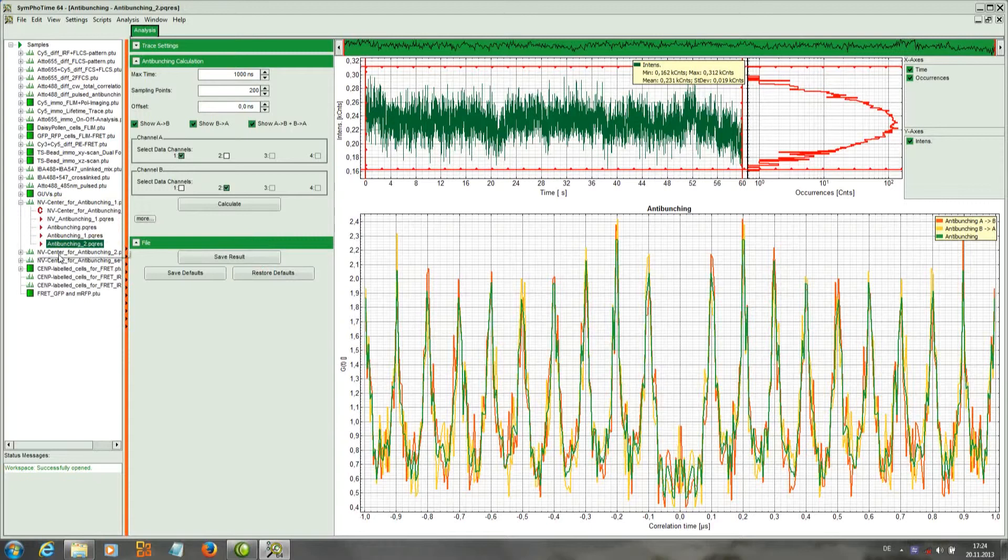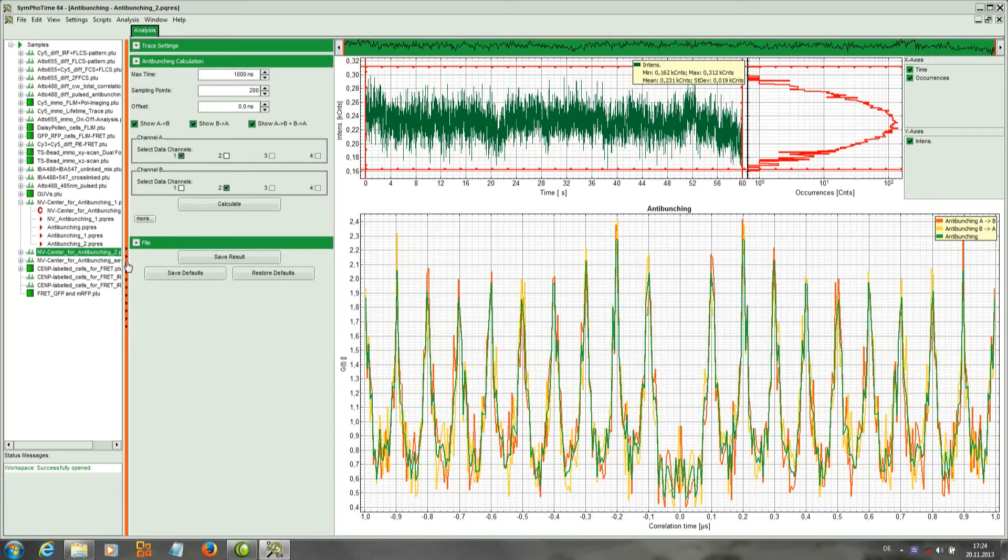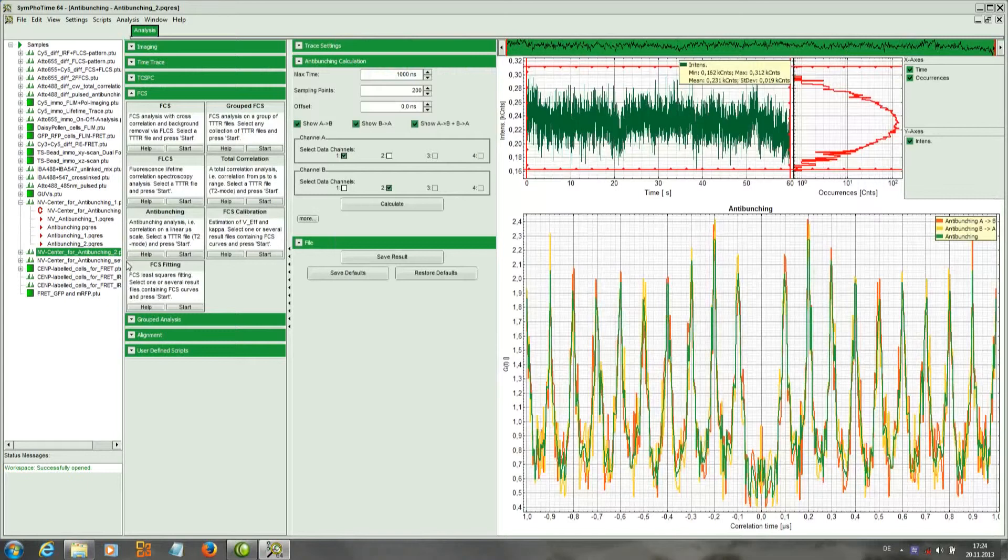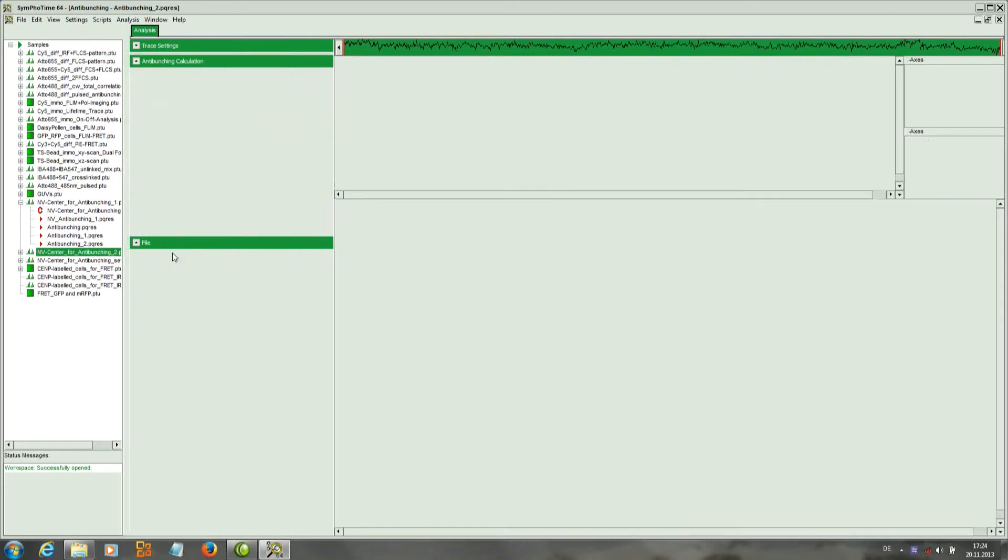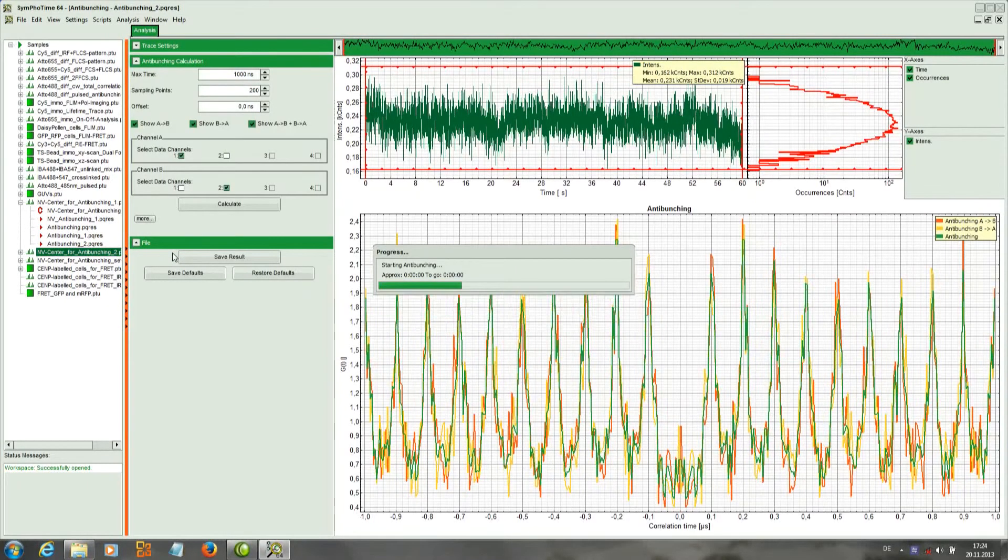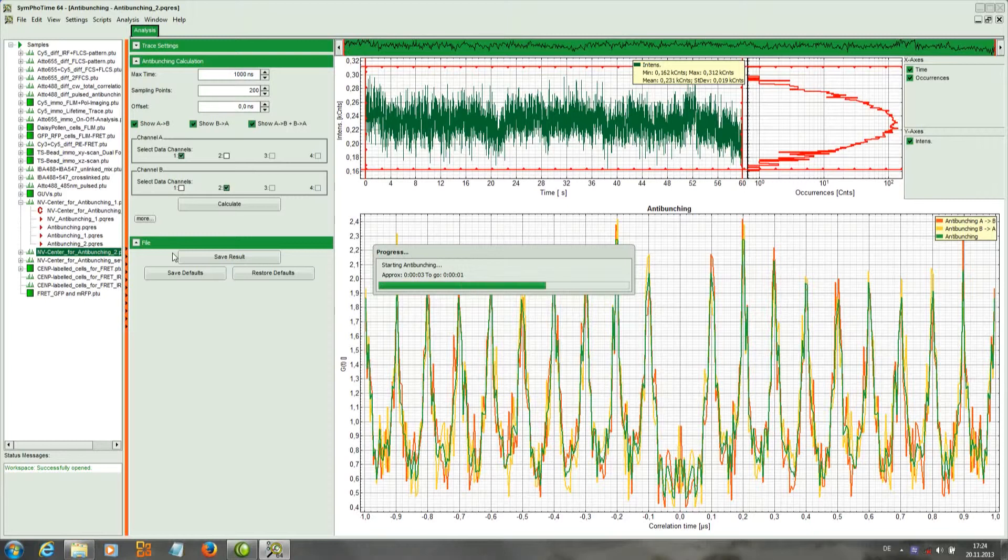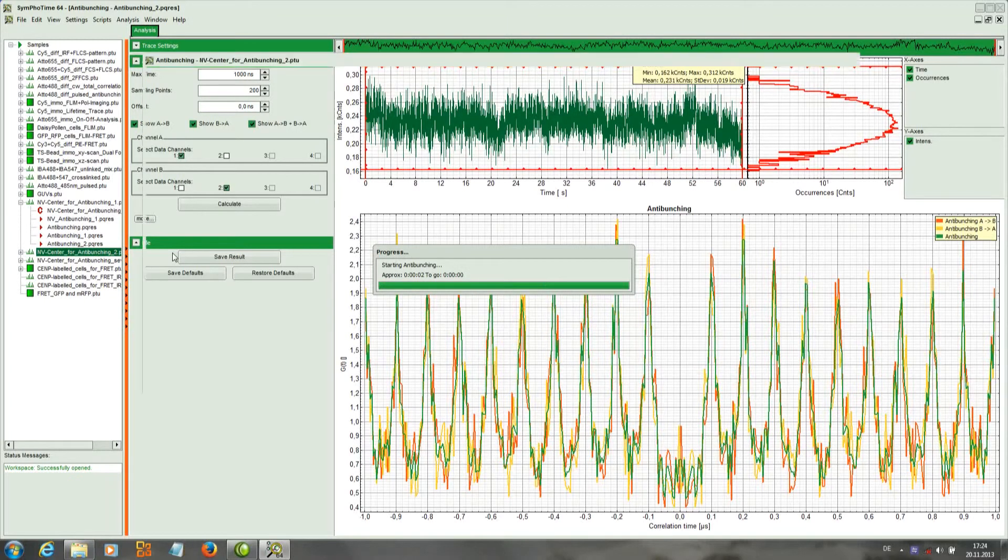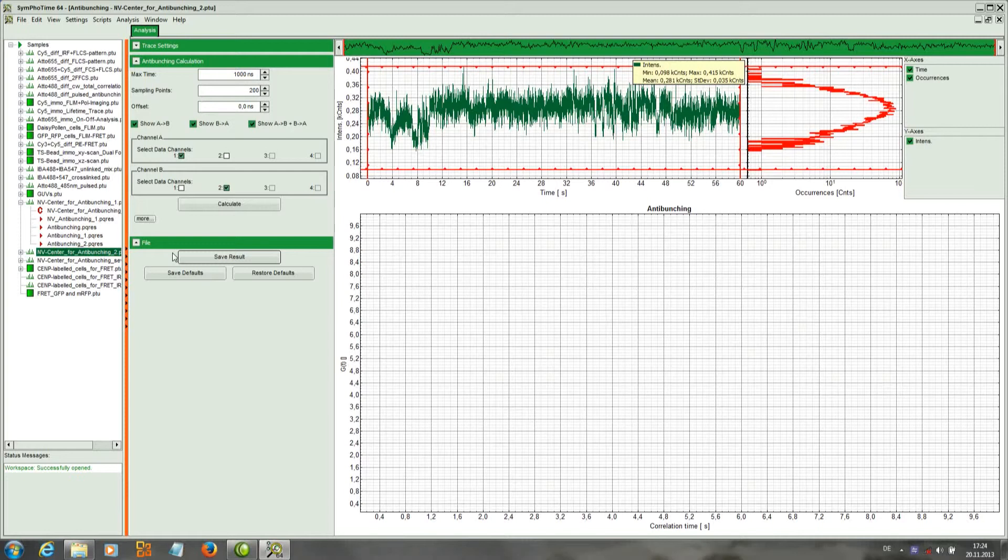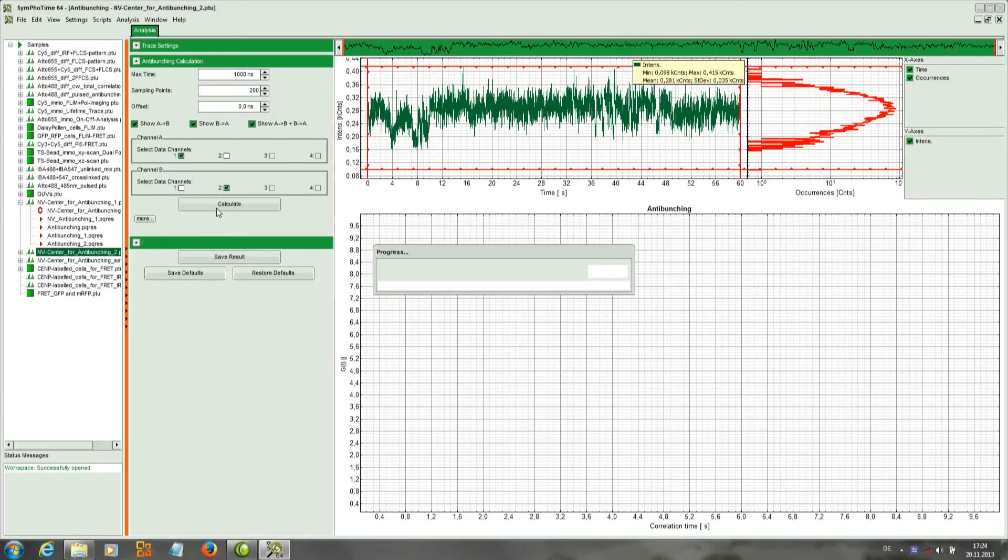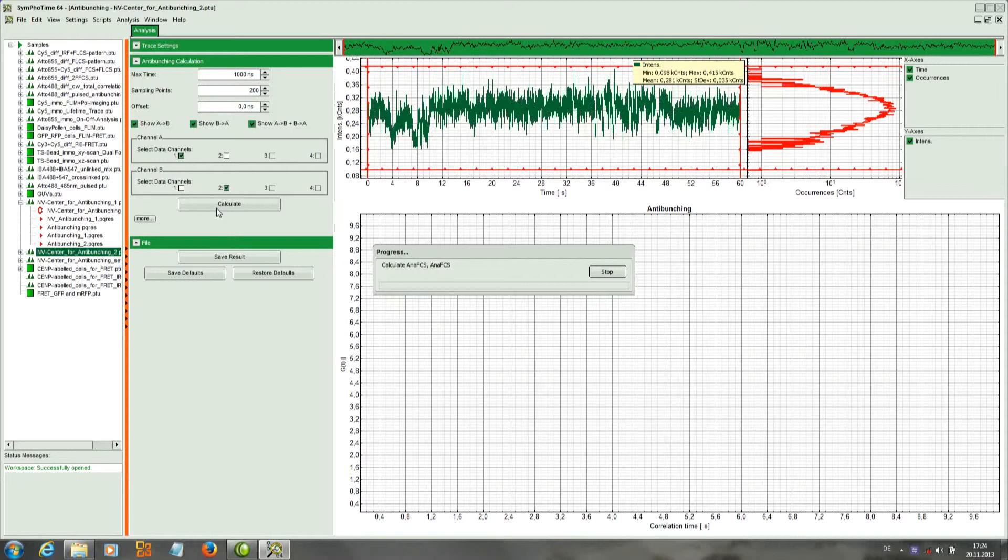We save the data and go to the next file for comparison. So this is also a point measurement on the nano-diamond. We again calculate the anti-bunching curve with the default settings.